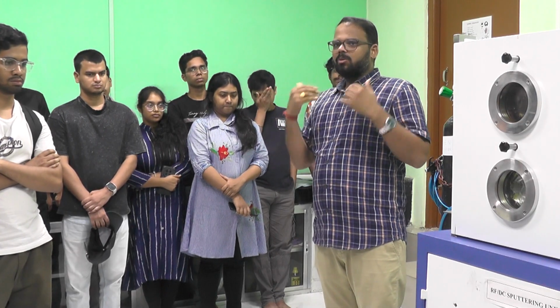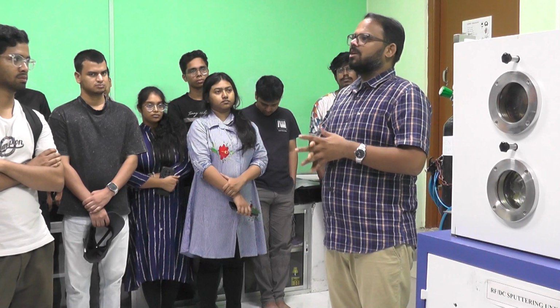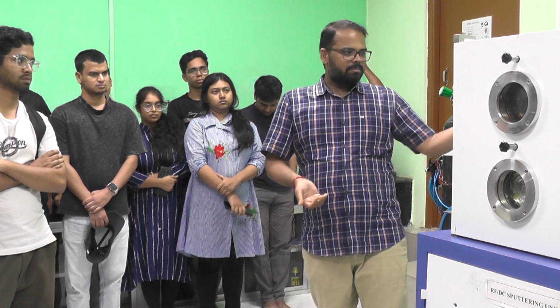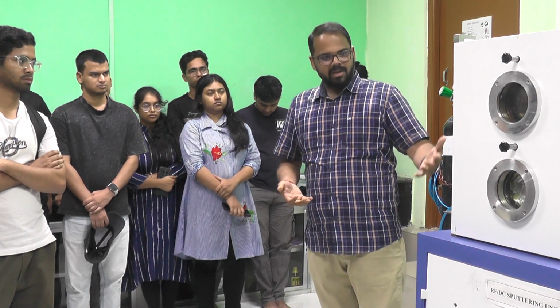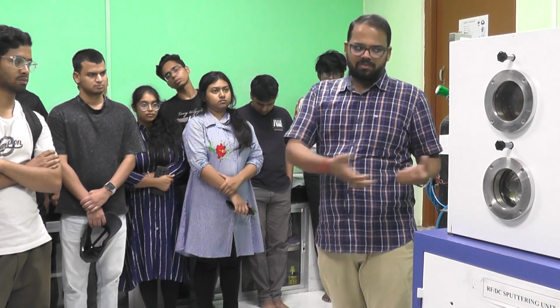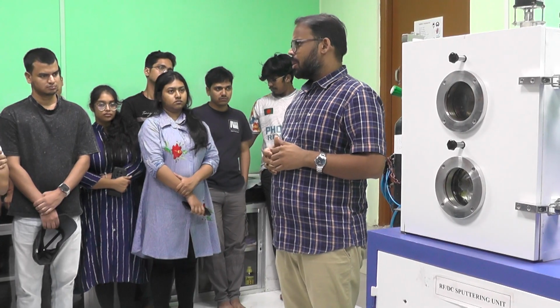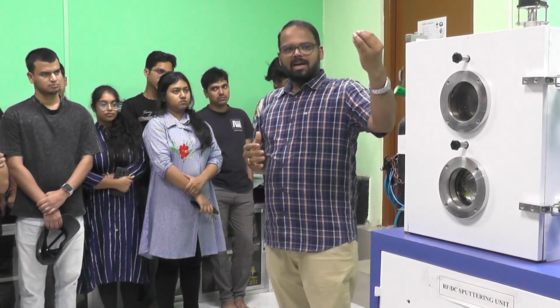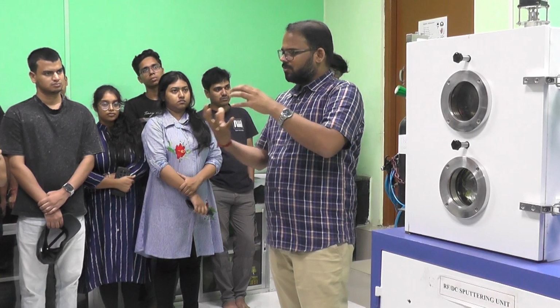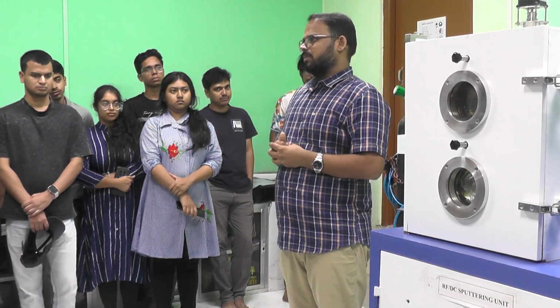You can read more about the co-sputtering method by which you can prepare this stoichiometry of chalcogenide based material, and then the appropriate parameters, the way you can see here. This is the MFC, mass flow controller, of different gases. You can provide that and you can control the chamber environment. And similarly, it has some heating element inside also. So if you want to make your deposition at some temperature, that also you can do.